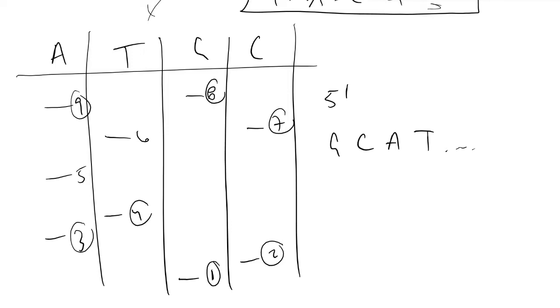And this was a huge breakthrough. The key restriction, though, is we are limited in the number of base pairs that we can sequence with Sanger sequencing. The problem arises when we have very long DNA segments, because once you get to 1,000 base pairs or thereabouts, the difference in mass and size between a DNA fragment that is 1,000 base pairs and a DNA fragment that is 1,001 base pairs is so small that it becomes negligible.